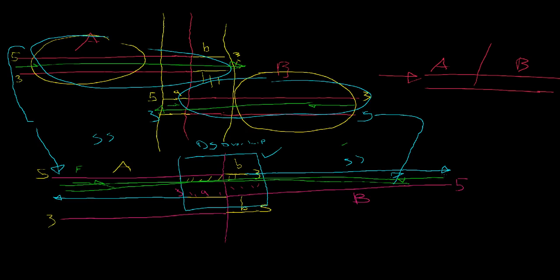We're going to have more oligos that are going to be priming off of the products and the reactants from this reaction, and we're going to be getting more of these A's overlapping with the B's, joining together, annealing together to create more template for a SOEing reaction to happen. And that's pretty much how the SOEing reaction takes place.